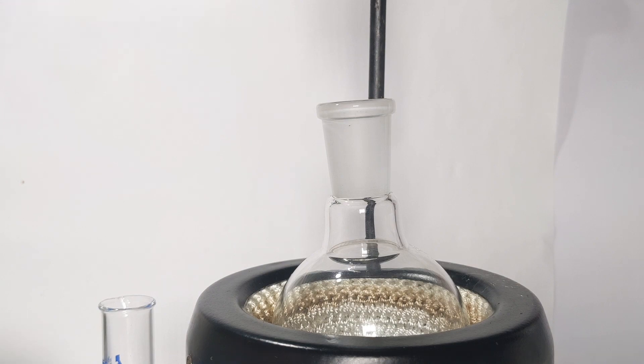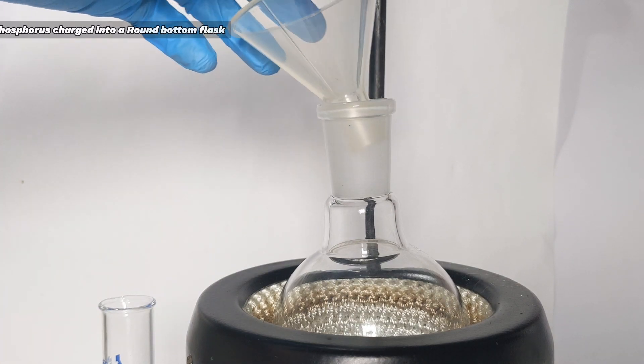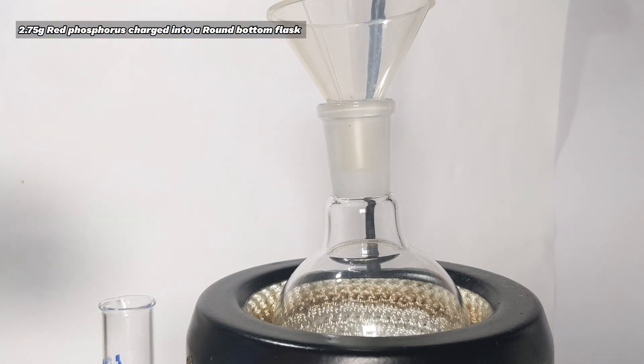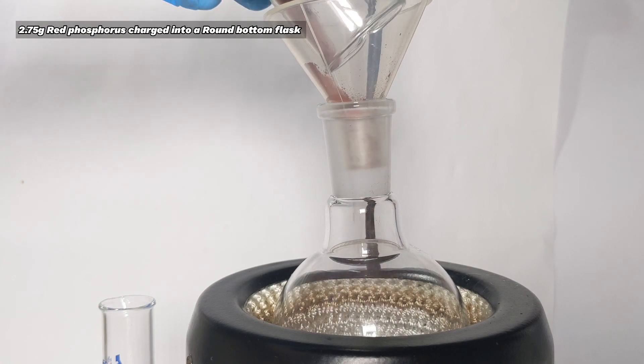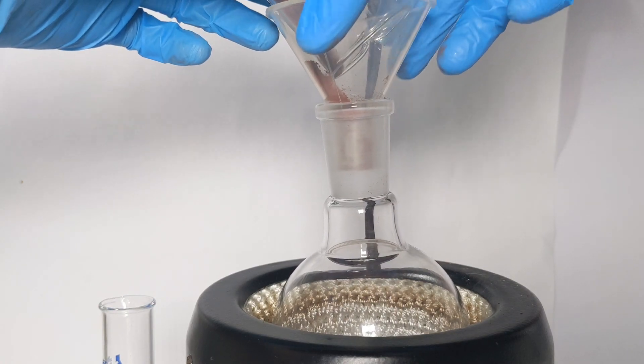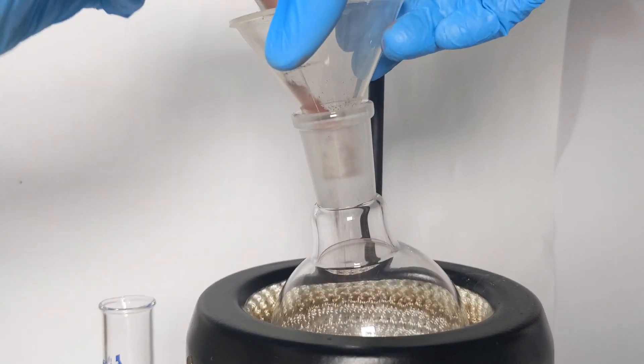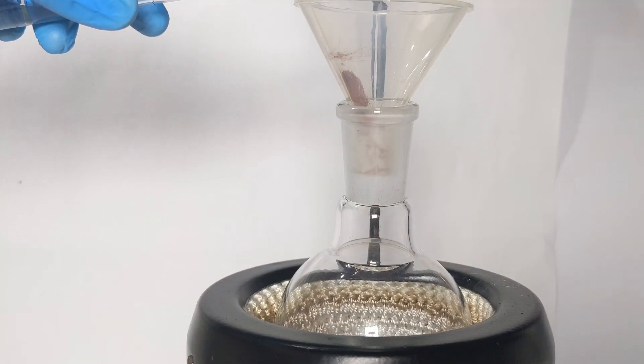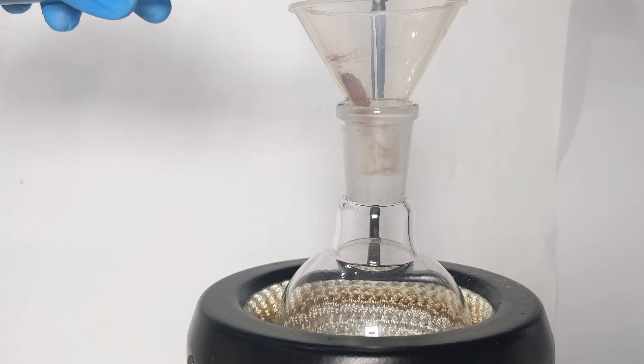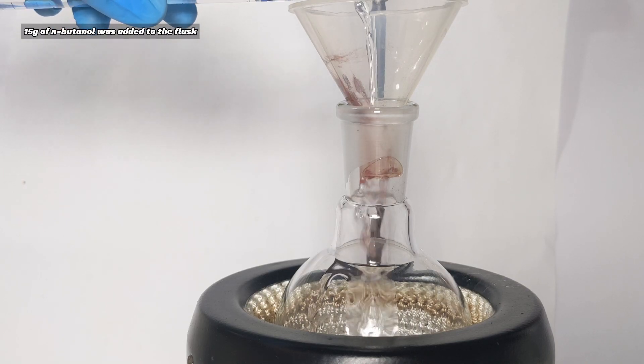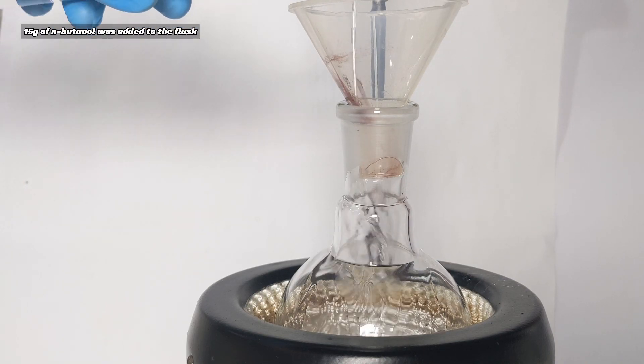The round bottom flask was charged with 2.75 grams of red phosphorus. You can see that the finely powdered phosphorus got attached onto the funnel and in the beaker in which it was placed. Both were washed down with n-butanol. Red phosphorus is flammable and care must be taken while handling it.